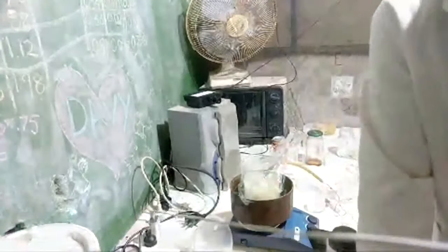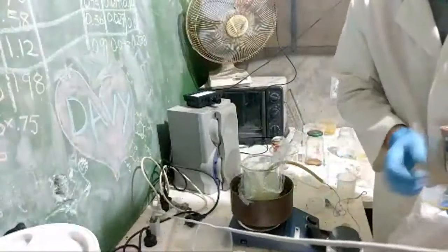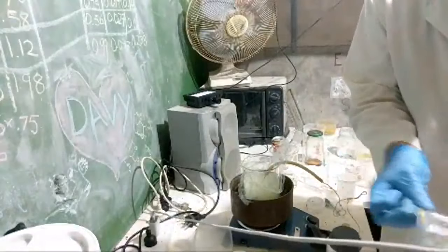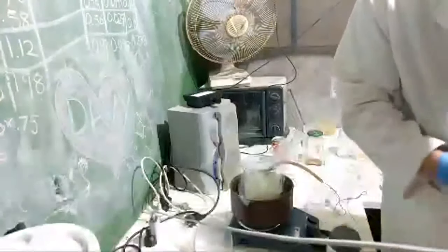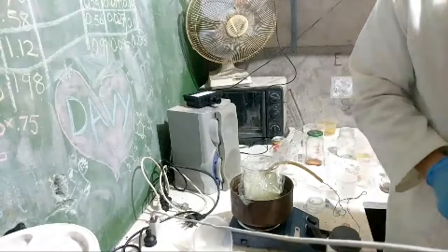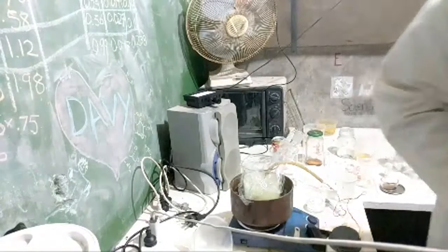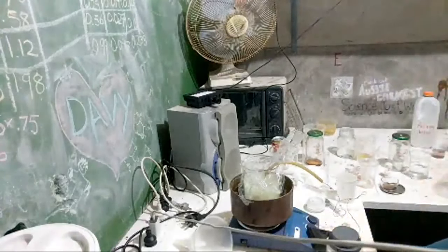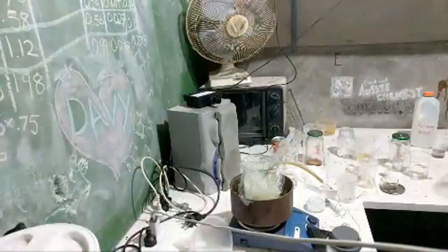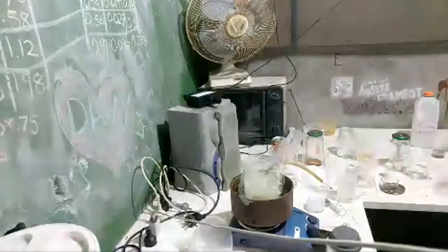This back in its bag so it doesn't pull too much water from the air. Alright, so now we should.